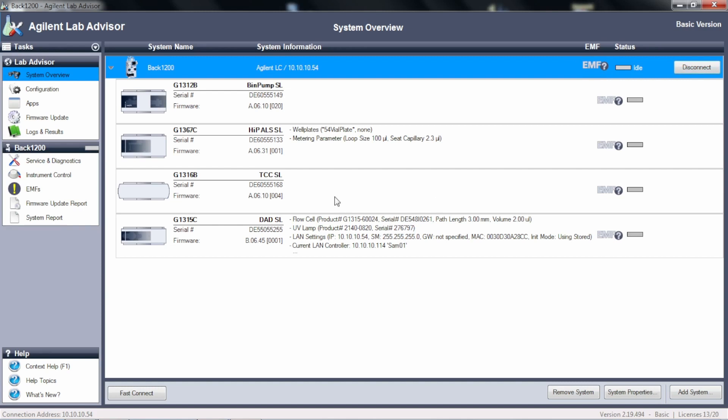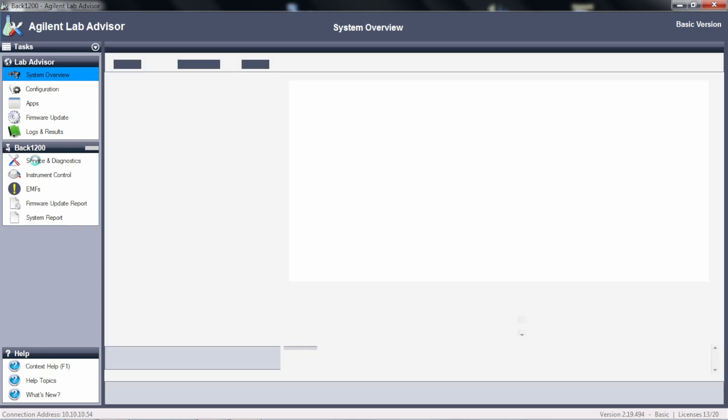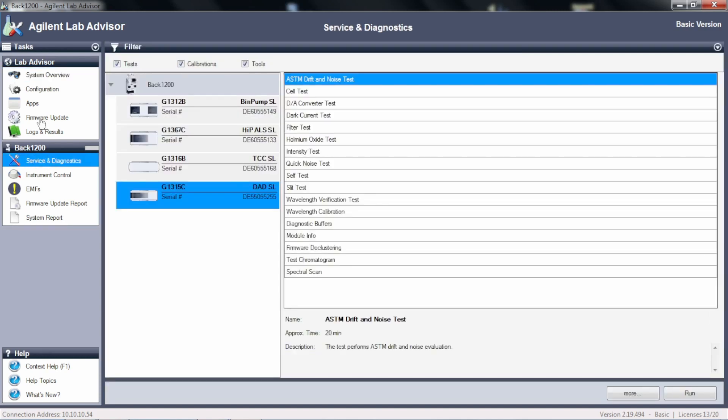So now we're going to go over to service and diagnostics. By the way, this is a great place to do things like your firmware updates. So now we're looking at service and diagnostics, I'm in the diode array screen, and here we have all the tests that we saw before.